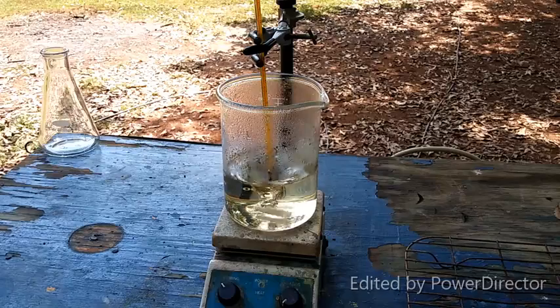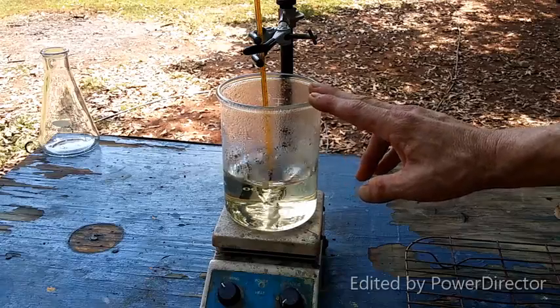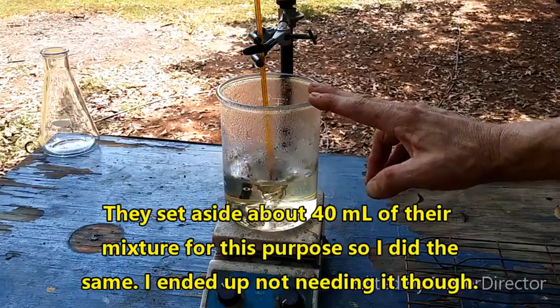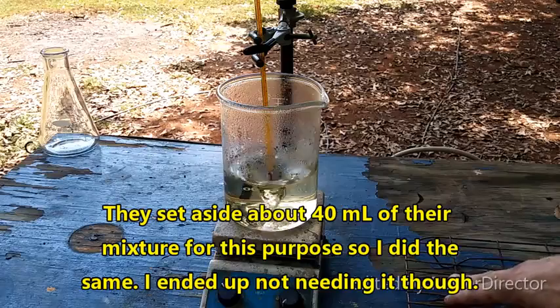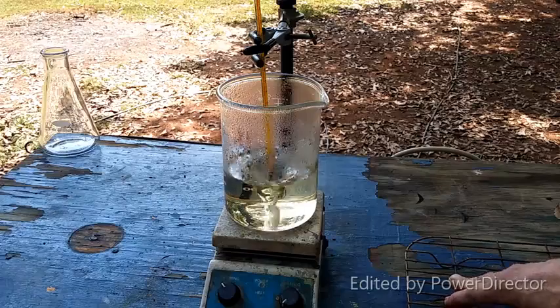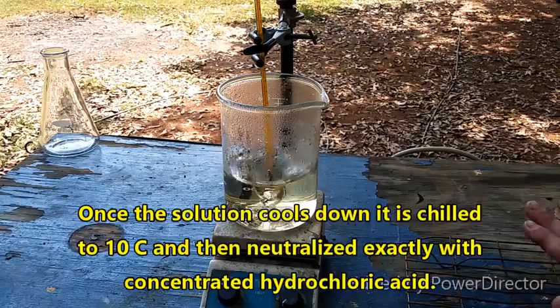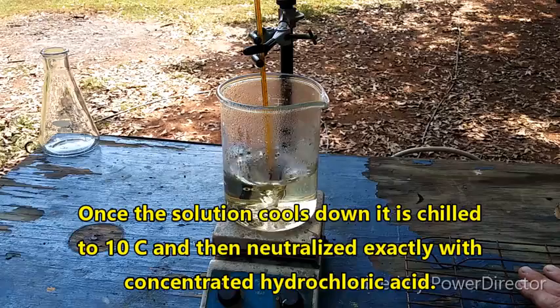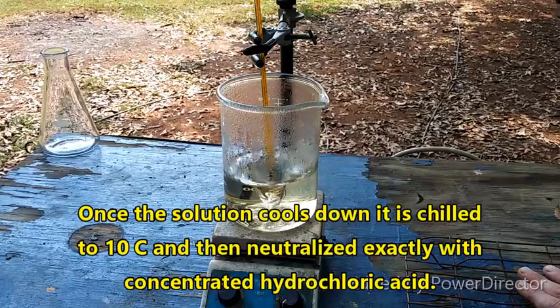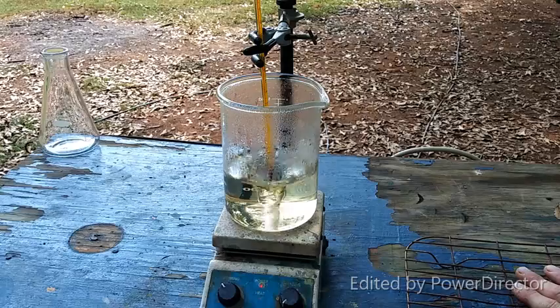ChemPlayer also recommends separating a little bit of this out after it cools down to set aside for the next step that's coming. So when we get back, I will have that all ready to go. The reason is that in the next step we're going to neutralize this, and it has to be neutralized exactly. You don't want to go over. We found that out the hard way too. So that sounds like a neat trick that they recommended, so we're going to try that. But anyway, I will come back here when this is chilled down and we're ready to move on to the next step.